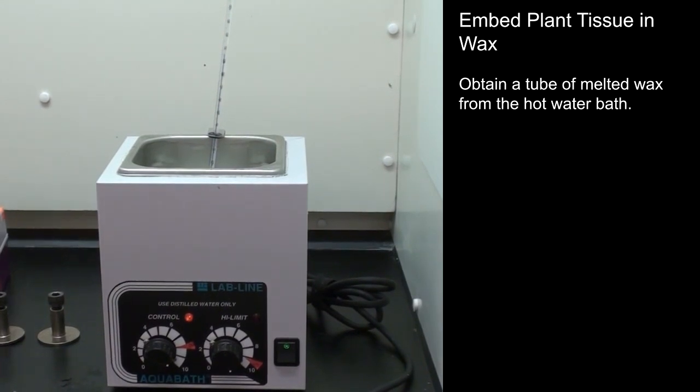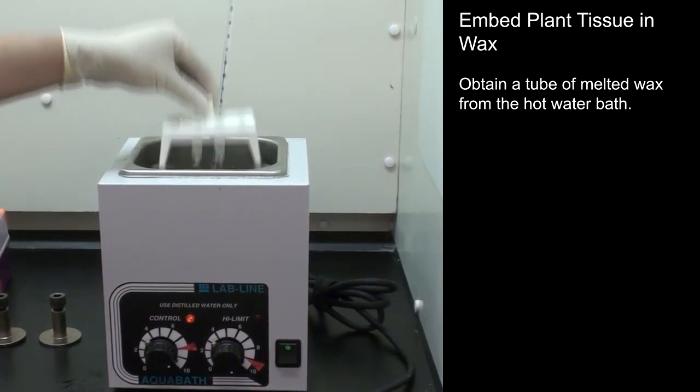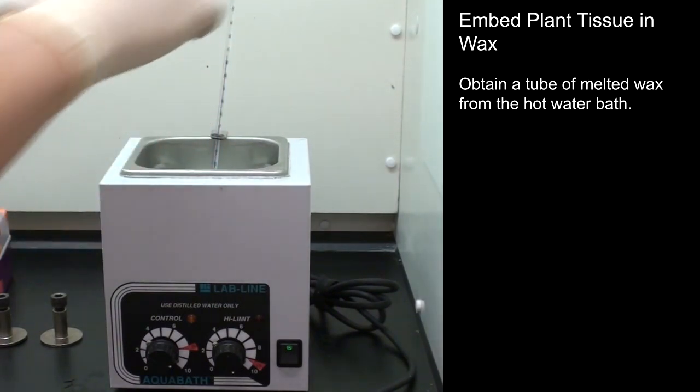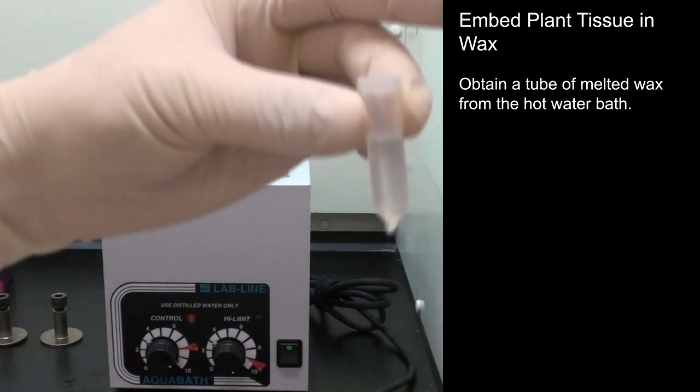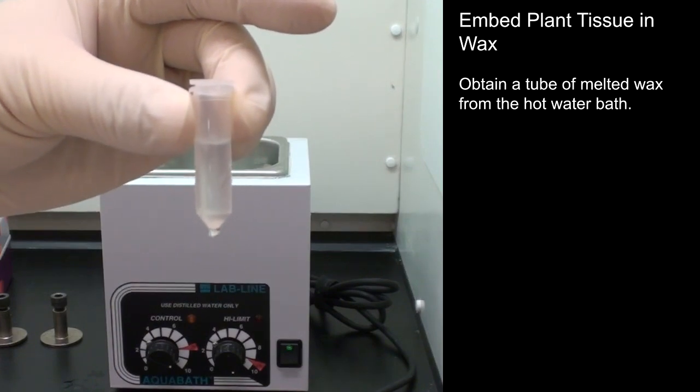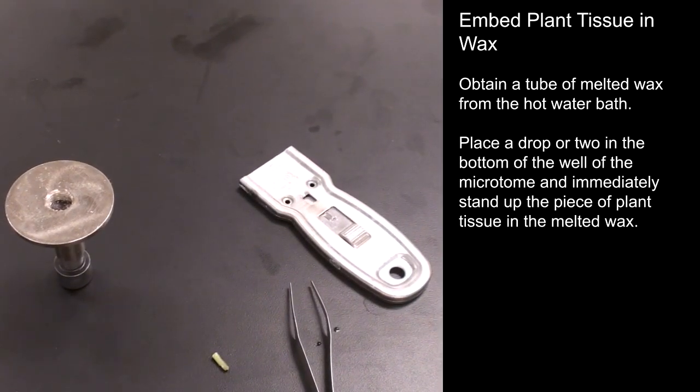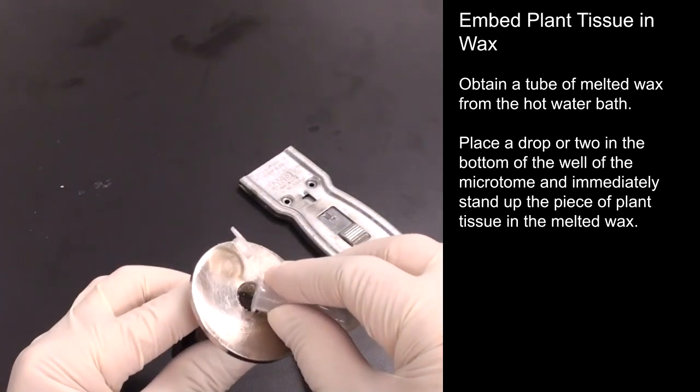Obtain a tube of melted wax from the hot water bath. Place a drop or two in the bottom of the well of the microtome and immediately stand up the piece of plant tissue in the melted wax.